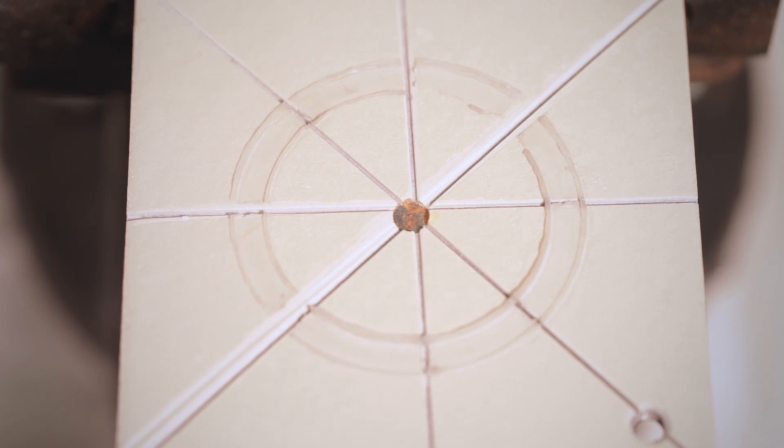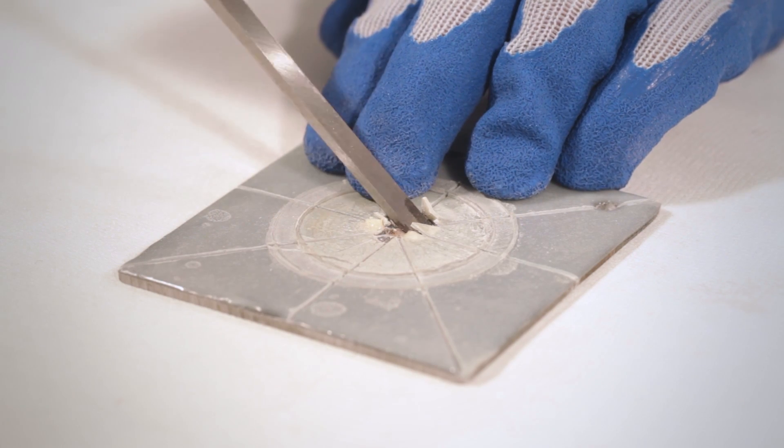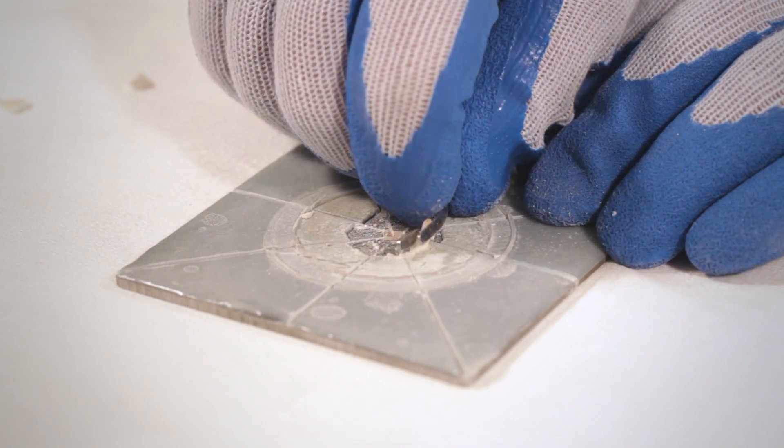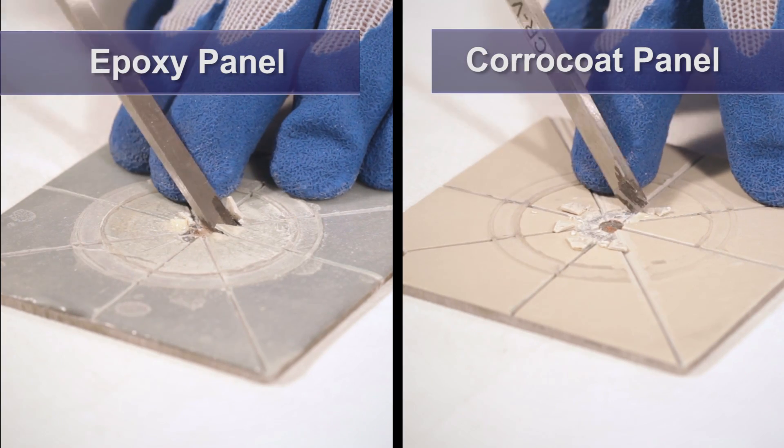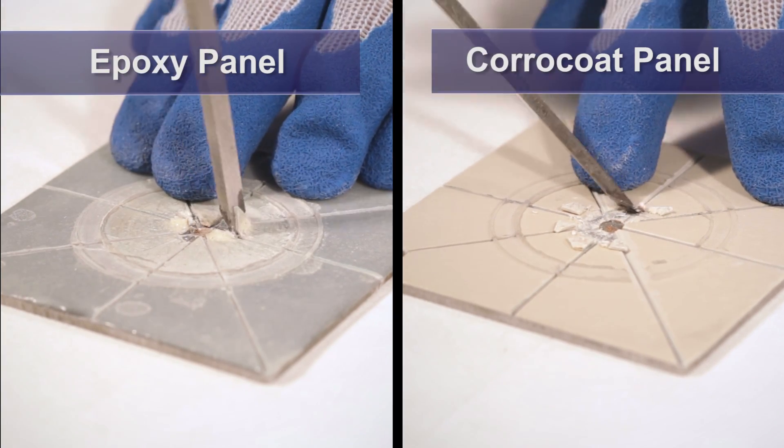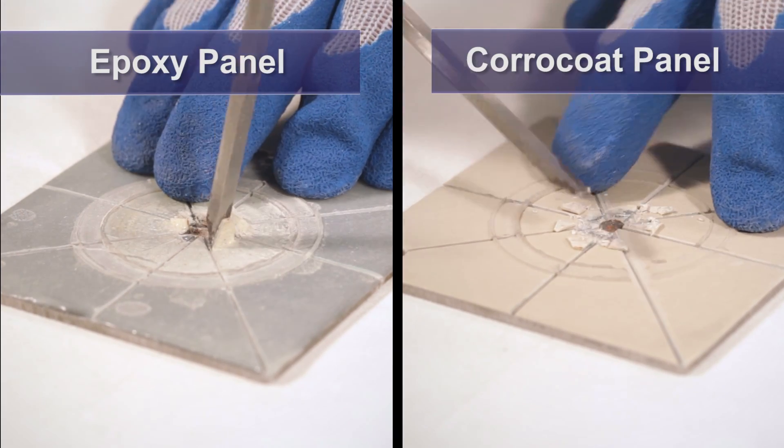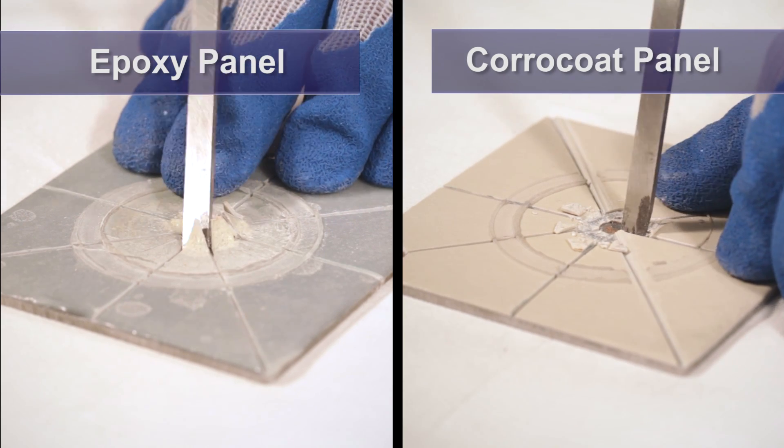A chisel is then inserted under the coating at the damaged site and used to gently prise upwards. The coating is broken away until a firmly adhered edge is encountered. In this comparison, the coating on the epoxy-coated panel can be easily removed with the chisel. The coating on the panel with the Coracoat glass flake coating is difficult to remove.